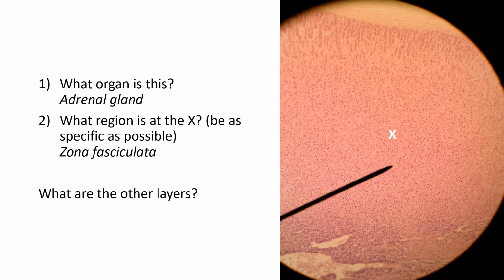All right, so this is the adrenal gland. This is the zona fasciculata. Once again, even though this is a terrible picture, this is the guessing game of, okay, I see a darker area in there, that must be the medulla. I see capsule over here. I'm kind of in the center next to neither of them. Let's just say zona fasciculata, because that's as close as we can get to accurate.